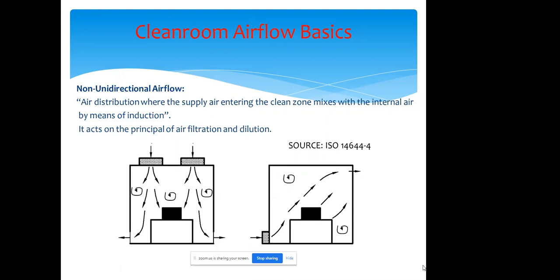This is another type of airflow where you have your air handlers or your terminal filter at the bottom, and the air is going in an almost upwards motion. And you can see you still have swirls around here and swirls on this side. So if you have particles suspended up here, they are going to swirl around in here and would not be washed out.